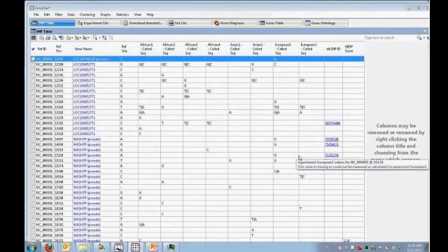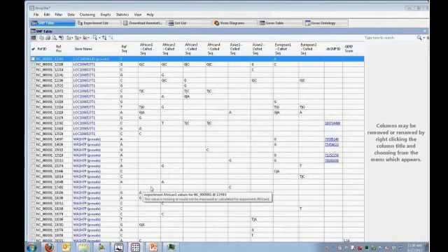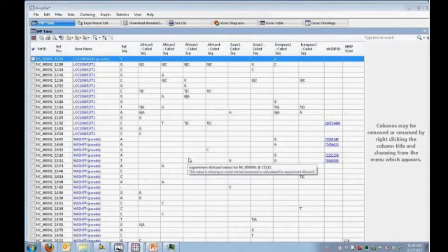Now I can also, depending on what I'm doing, fill in and bring in information that's missing, and that's the missing SNPs that I mentioned briefly in the BAM assembly package. So, you know, if a SNP is missing because there was no coverage, or it's the same as a reference sequence, at the exome scale, that's a massive amount of information. So you may or may not want to bring that into your experiment, depending on the size of your experiment. I didn't for this particular experiment, but it is possible to populate these.